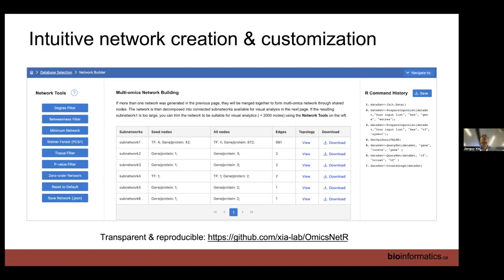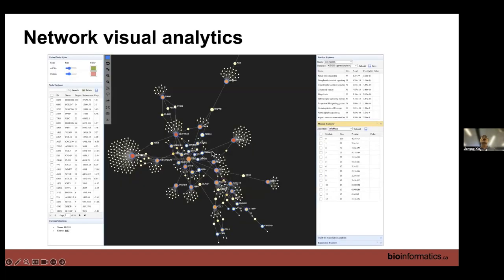So it's just like a normal distribution. And we always find the same patterns: a huge network, a continent, and then a lot of small islands. Most of our hits are going on this huge island, this huge continent. So we can always visualize, explore, trim it, and customize it. This is something I spent 2 minutes on to make it more spread out and less overlapping.